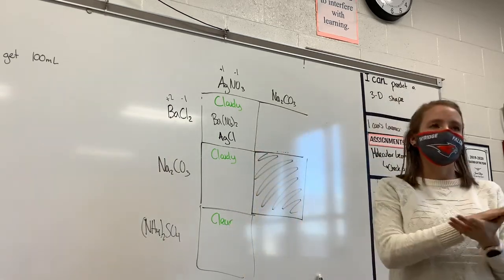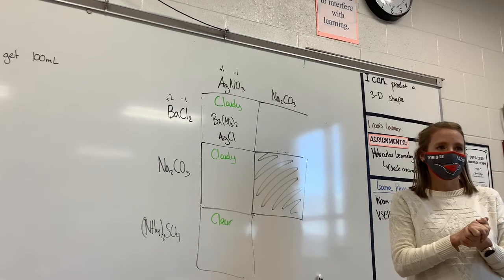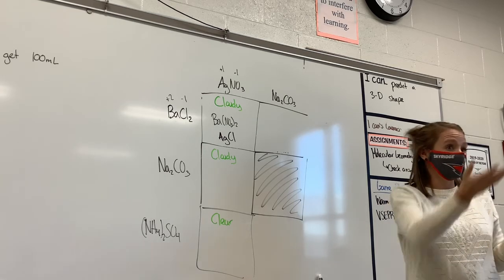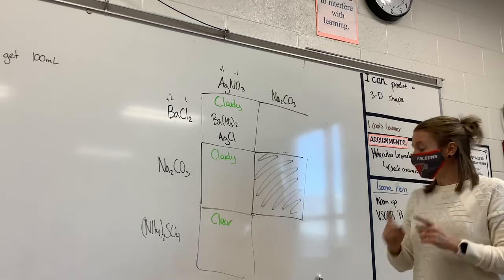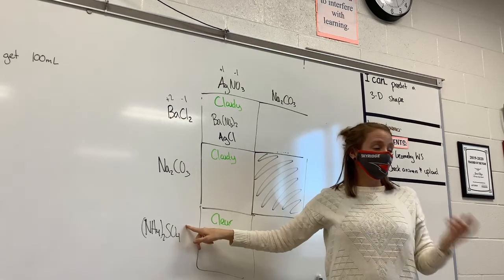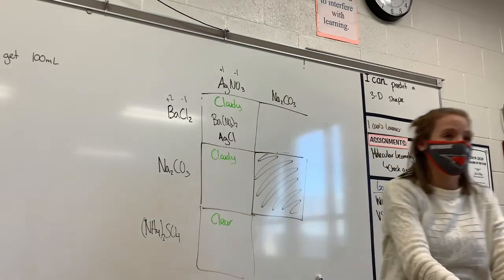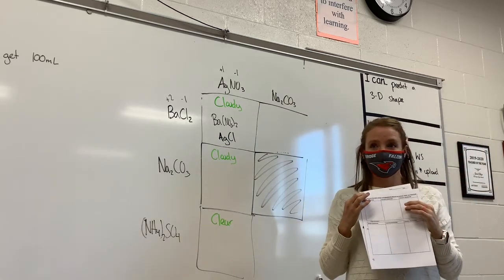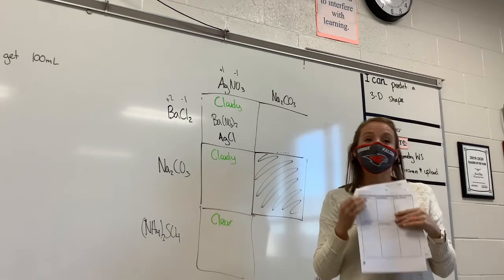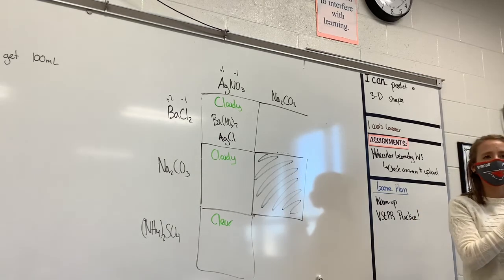Now, let's start with the soluble list. So how do I know if something is soluble? It's just dissolved, right? So what does it look like? Water. Clear, or mostly water, right? So first off, we know that all the things we started with are soluble, right? So all the things you used would go in the soluble substance list. Yes, there's a lot of sorting that's going to go on here. Now, there are other times when we can guarantee things are soluble, and that's from the reactions.